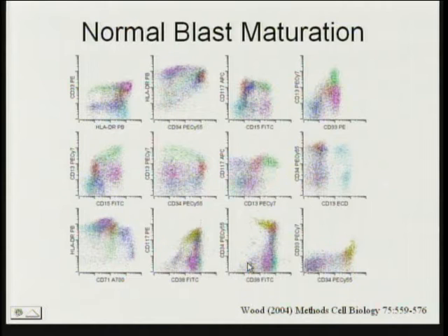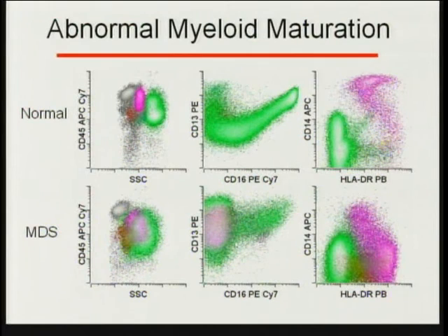And each lineage of cells, as they mature from these early progenitors to later stage forms, follows a very characteristic maturational pathway, which we've now mapped out and can use as our normal template for normal maturation. So we can take all this information from all these different lineages that we're evaluating and put it together and use that information to make diagnoses of particular types of malignant neoplasms.